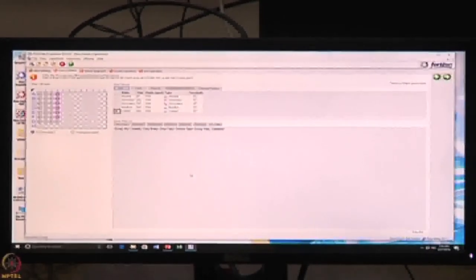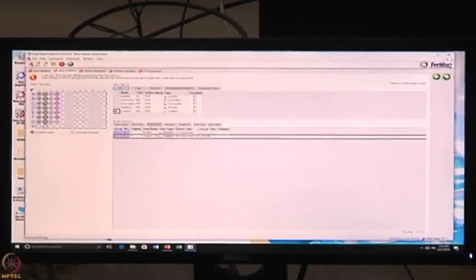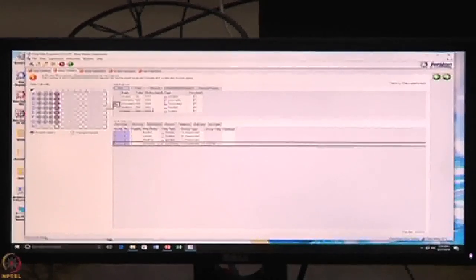We have to assign them so the instrument goes according to the backend flow, the robotic arm. So what is the first step here? I will take this arrow mark and double click on this. It is just a cross mark. The first step is your baseline. The next step is loading, so I take this arrow mark and double click again. Then the third is one more baseline, double click. The fourth is your association, double click on this. And for the dissociation, you can ask where exactly it happens.